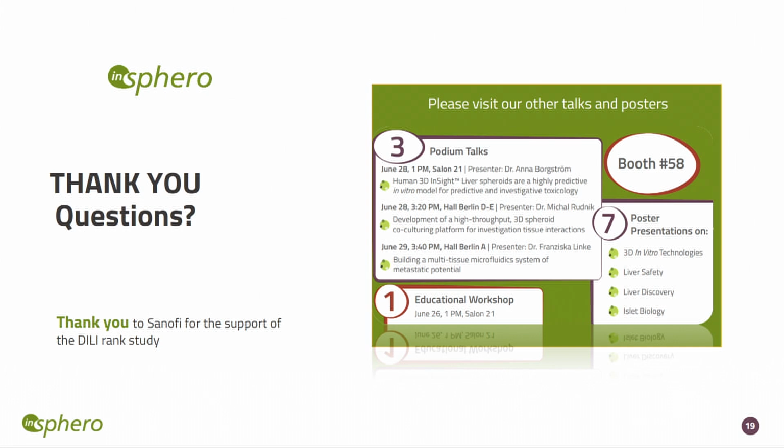So first of all, this is the preliminary data, so we don't know how the specificity and sensitivity will be in the end after screening all these compounds. I think it's an interesting point to look into also the mechanism behind toxicity, or to see if there's a certain toxicity which we detect better than others. With the false positive compounds, so far we haven't looked into the reason for them being flagged as positive, but this could be something we do after we have finished analysis of the whole group of compounds.